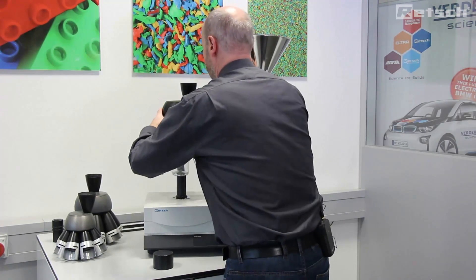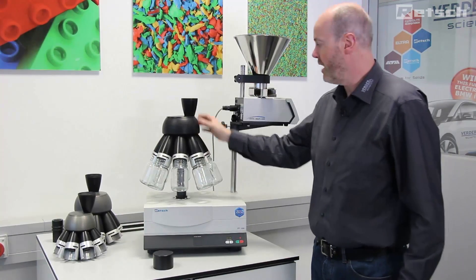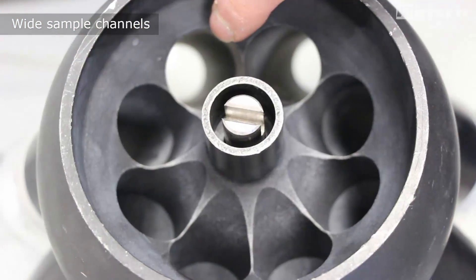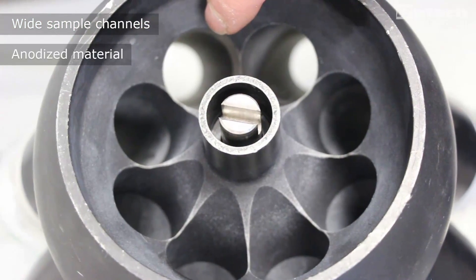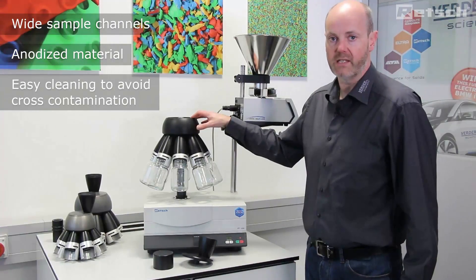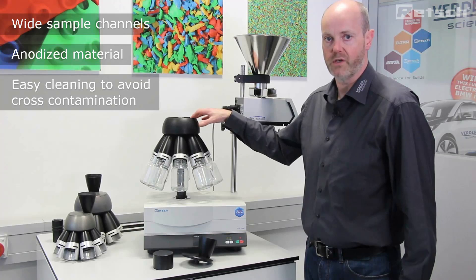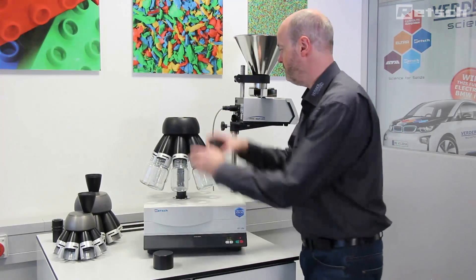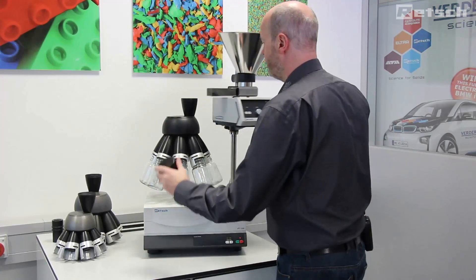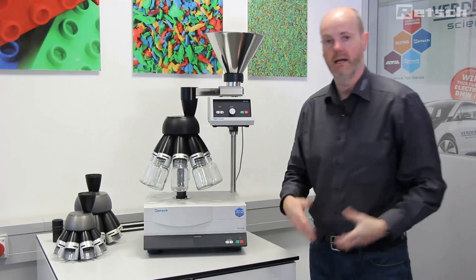After cleaning, we can simply put the dividing crown back on. All of the sample channels are very wide and made of anodized coated material. This facilitates very easy cleaning to avoid cross-contamination between each sample division process. We can simply reassemble very easily, without a tool, and very quickly.